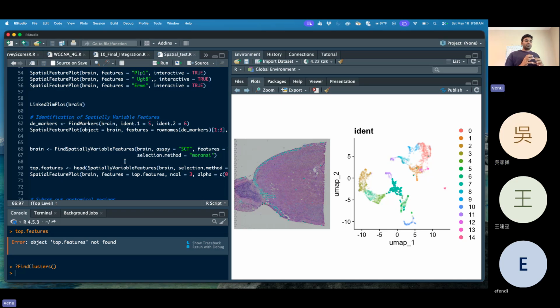So thereby we know this region, suppose this is a brain posterior region. These are all epithelial cells, but this region is highly associated with epithelial cells and other cells. They are closely interacting with each other. Suppose this particular region is interacting, so it is in disease condition. That is what they showed. In this particular region we observed interaction between these cells and epithelial cells.